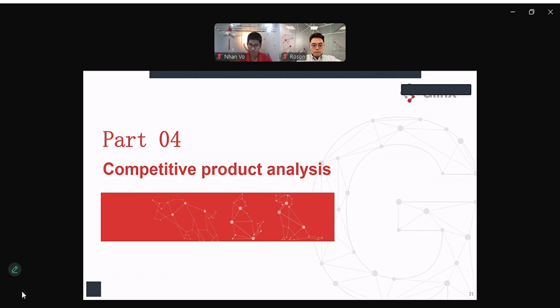And the last reason is the speed of the qPCR. Even though it is not as quick as the LAMP method, this kind of method can already satisfy the requirement of disease diagnosis and treatment, because within the clinic, people finish the test, get the results, and can provide the treatment plans for the animals.